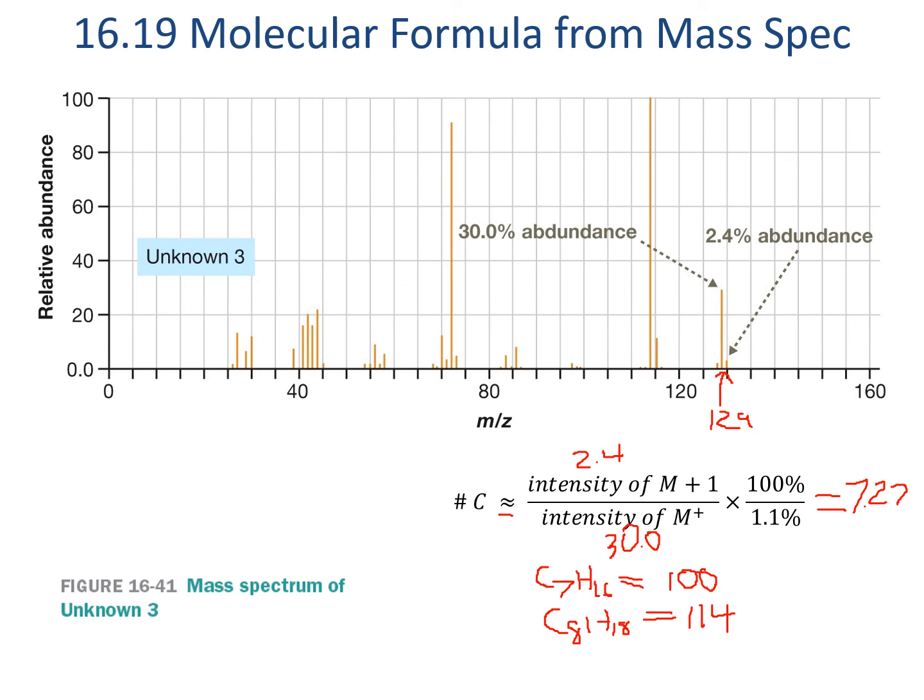We could try to put in another carbon, like another CH2 group, we are saying that it's about, and this is dealing with statistical data. But if we added another 14, we'd be at 128, and there'd be no way of getting that odd number here, the 129. We typically only get odd numbers, at least in any sort of common ions that don't have halogens, through nitrogens, right? Because when a nitrogen is added to a molecule, say like if we have a propane, that would have C3H8. It has a mass of 36 plus 8 is 44.